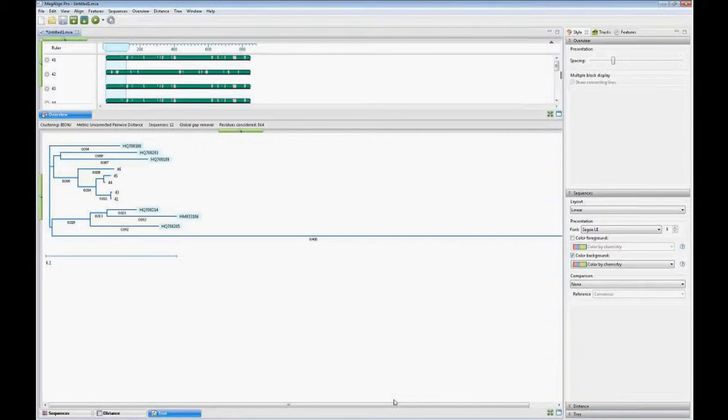So that concludes the assemble in groups. I can now take any additional questions that have come up. Okay, we have a couple of questions, and they're both about data, adding data.